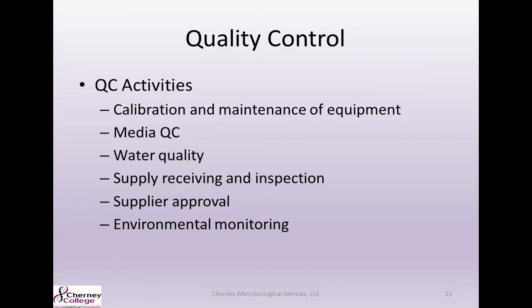Another important GLP is QC, otherwise known as quality control. You're going to want to make sure that you are calibrating and performing maintenance on your equipment. And obviously you'll want to have that documentation to prove it. You'll want to perform and record media QC. You'll also want quality control of supplies that come into your lab and a good environmental monitoring program to ensure quality results and no contamination of customer samples.